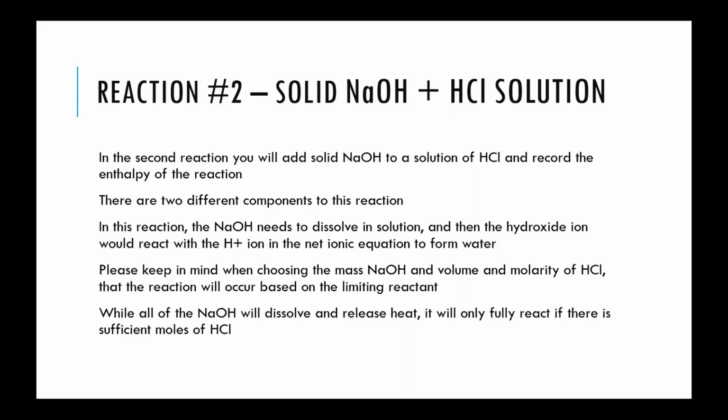That does require energy, and there's an enthalpy associated with that. After that's completed, the hydroxide ions are reacting with the H+ ions, also generating heat and having an enthalpy change. So this experiment has both of those things combined.